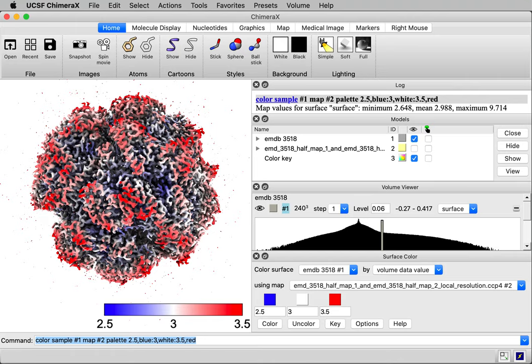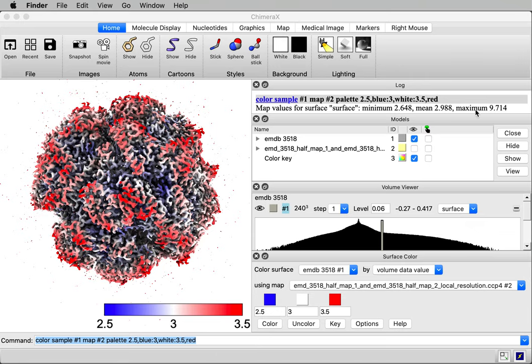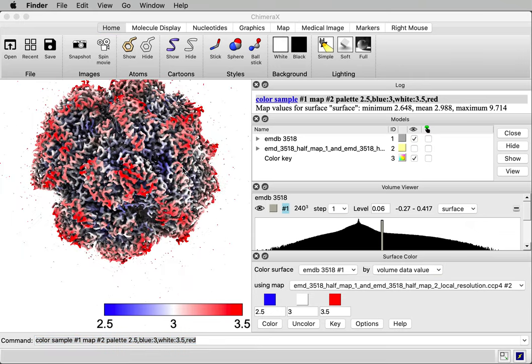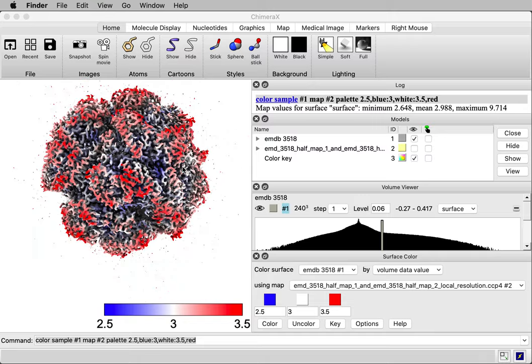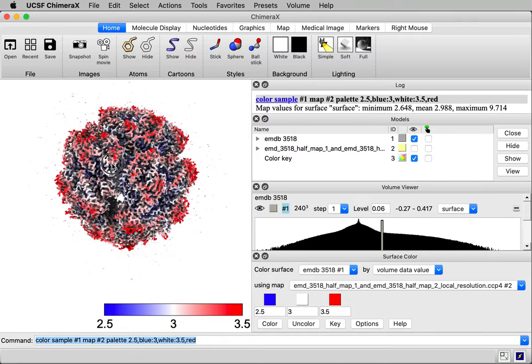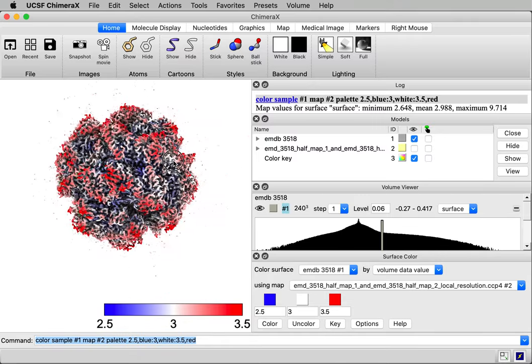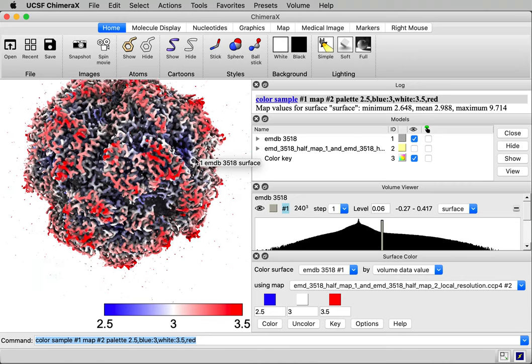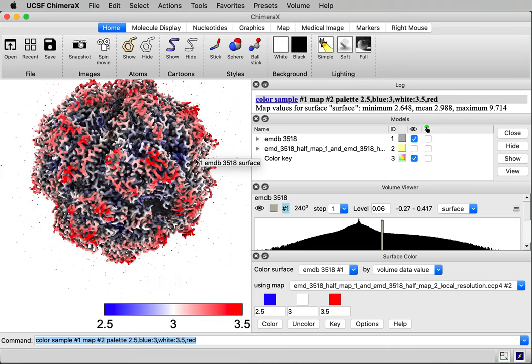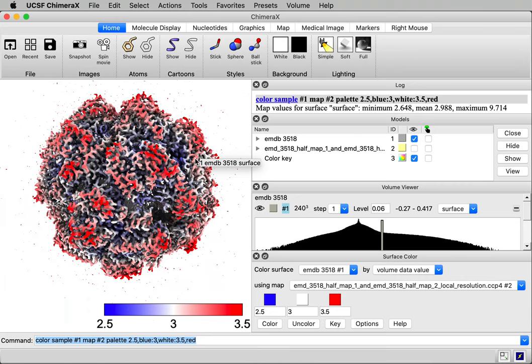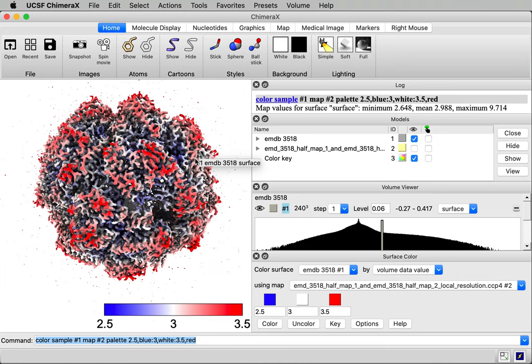I'm going to show you how to color a cryo-EM map by local resolution using ChimeraX. Here's the end result we're going to get. This map has red parts at 3.5 angstrom resolution and blue parts at 2.5 angstrom resolution.